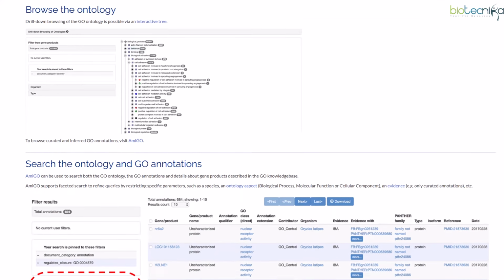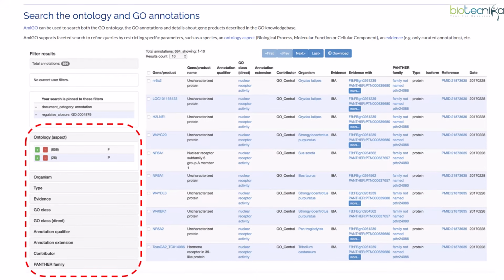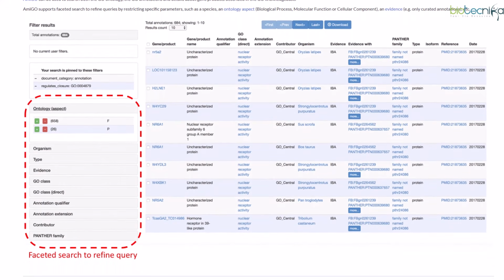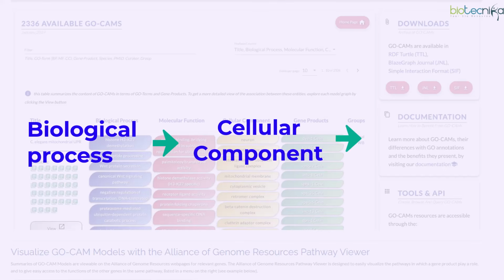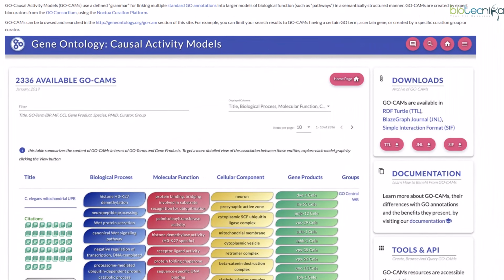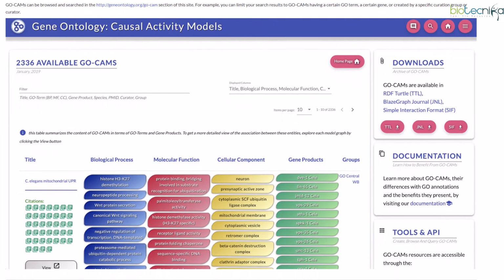So what is gene ontology in the first place? Basically, this is a computational method of storing how a particular gene product, or basically its function, can be divided into multiple components at the cellular level. It involves three categories: biological process, cellular component, and molecular function. We'll look at both of those things, that is enrichment analysis and gene ontology, using the same server. So without further ado, let's get started.